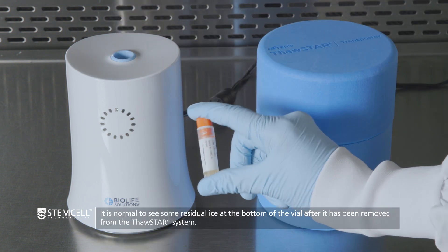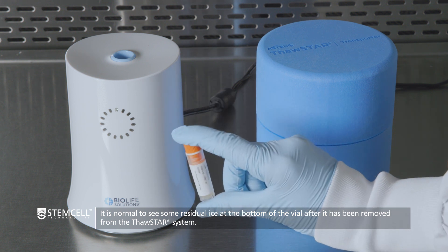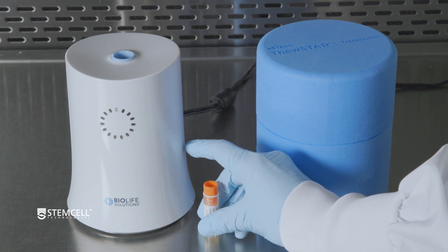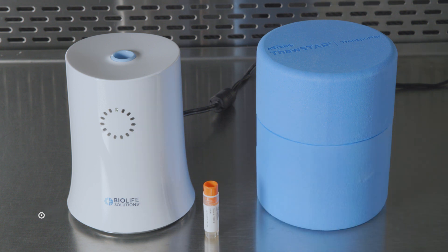Manually agitate the vial gently from side to side to equilibrate the liquid temperature until no ice can be seen. Your thawed cells are now ready for your downstream protocol.